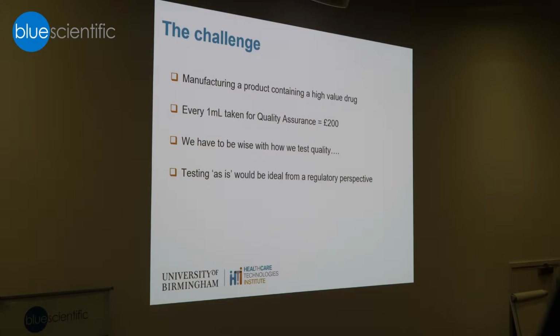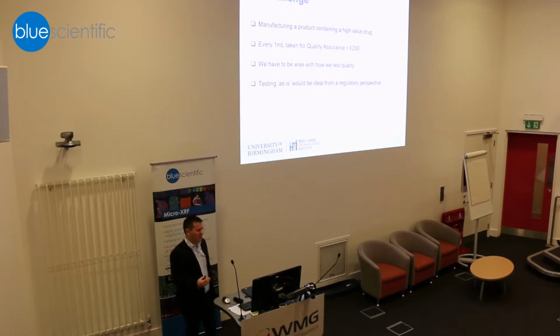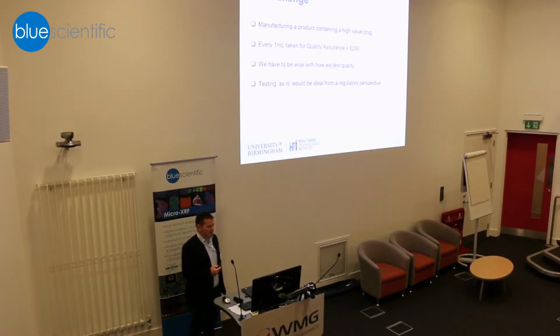So we have to be really smart about what techniques we use to analyze changes in chemistry in the material overall. Regulators are quite pragmatic actually. You can use pretty much any technique you want in the eyes of a regulator to look at changes in chemistry as long as you can validate it. The problem for us, from a biological perspective, is that there are lots of assays out there which indirectly measure concentration or indirectly measure the form of something, but the reliability is often called into question. In other words, whether they can cross-react with other analytes in the system.